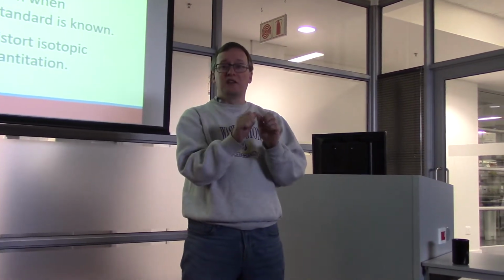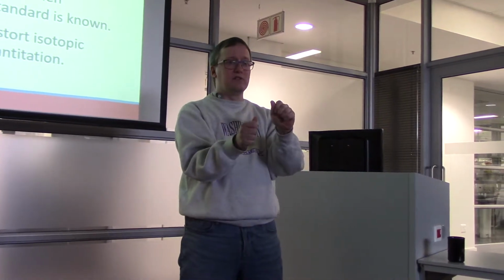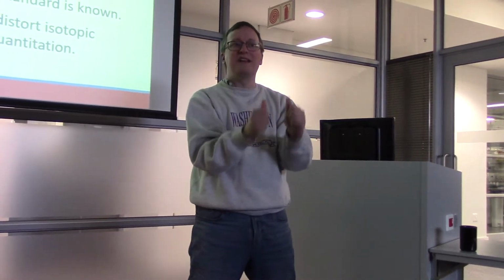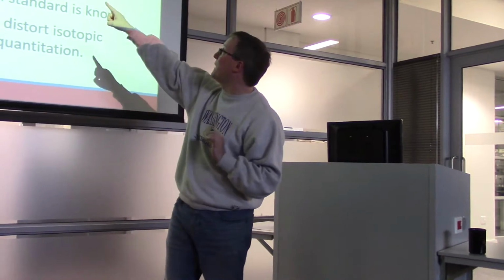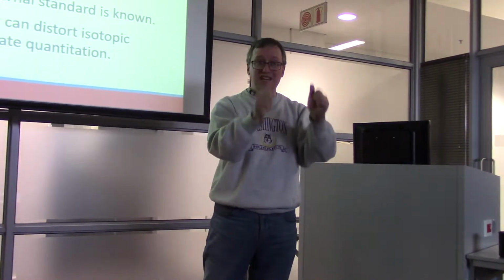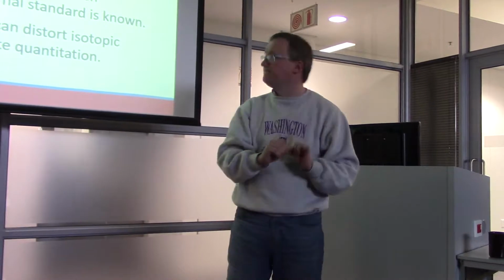You would expect that a given peptide from these two samples that appears in both heavy and light forms will elute at the same retention time. But they're going to differ in the mass to charge value they inhabit. Do you see that? Okay, so we expect that the biochemical property of hydrophobicity is not changing. The retention time does not change. But the mass difference is discernible easily by today's mass spectrometry equipment.